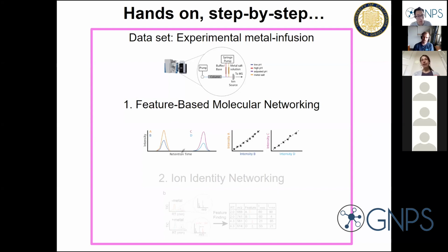We've modified our mass spec setup in a way that allows us to start to find new metal binding molecules. Instead of running our experiment using standard mass spec conditions, we've now changed our conditions, and so now we're doing what we call native metabolomics.